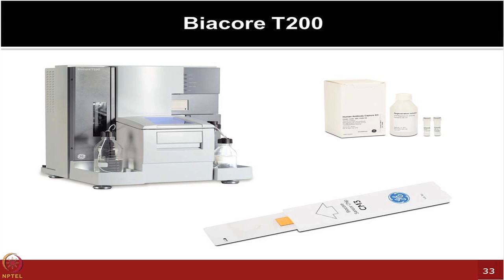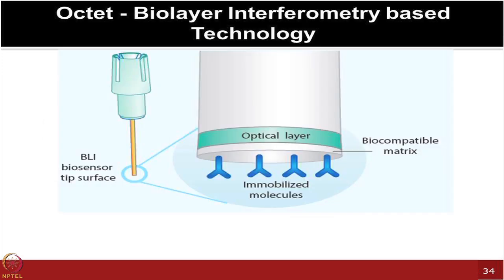So many times, if you are in the discovery development mode and you have hundreds of compounds or libraries to screen, this may not be the best platform to start with, because you are limited by how much cost you have to screen that large a number of compounds. So new technology platforms like the one I'm showing you here, which is a Biolayer interferometry based platform, can be very powerful for a first round of screening.